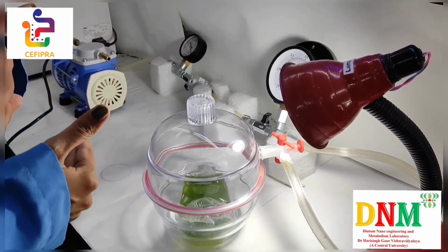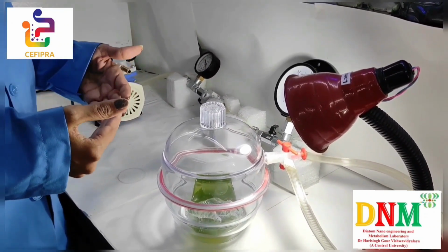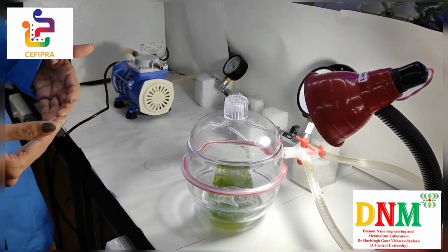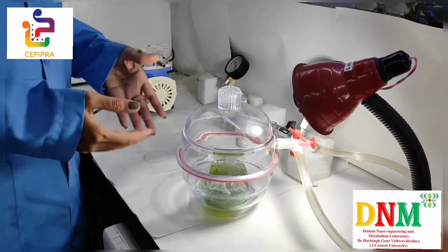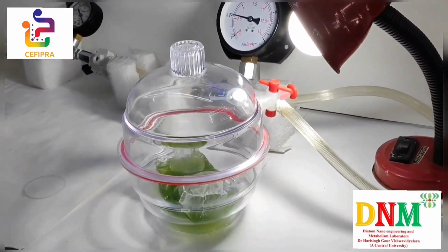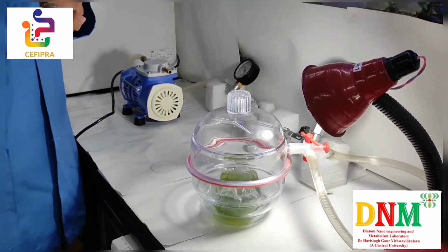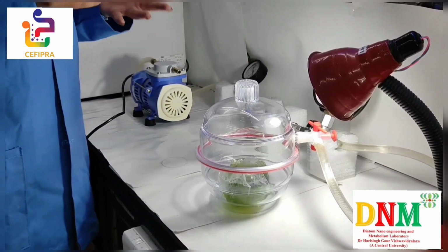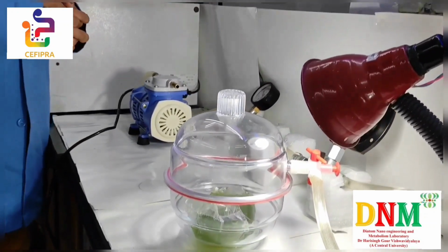so as to simulate the environment for Mars. We want to grow the cultures of the diatom as well as Haematococcus, and we want to see how they survive. Since both of them are very robust microalgae, and they are supposed to live in high CO2. So that is a small experiment where we are simulating the microalgae in Mars environment, and if it works, that can be a really big help for further experiments at a higher level, probably where in Mars there can be culturing of the diatoms in such big balloons below the lake waters. And it's a high profile dream. I'm not saying much, but yes, this is a small experiment which we are doing over here.